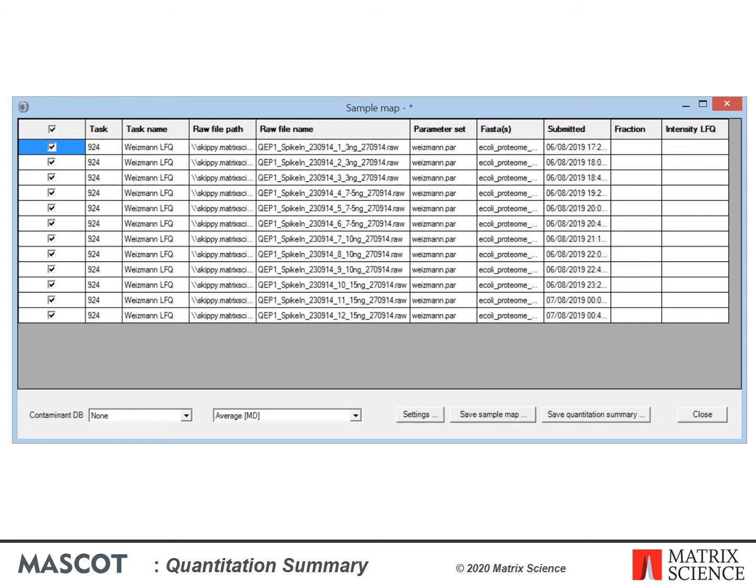This is particularly important when samples have been separated into large numbers of fractions. You don't want to have to type in every individual fraction number. Just sort appropriately, select the cell range in the fraction column, right-click and choose Fill with Integer Series.